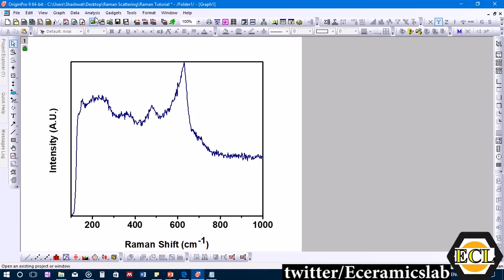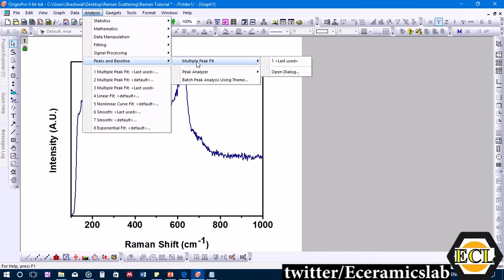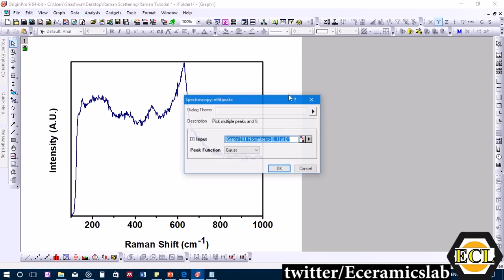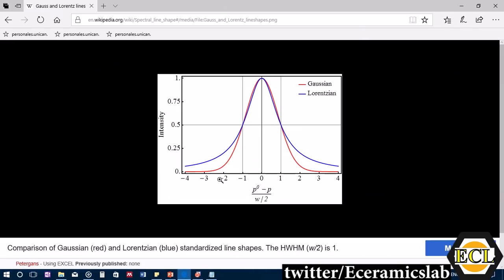To start the fitting, we go to Analysis → Peak and Baseline → Multiple Peak Fit, and click 'Open Dialogue.' It asks for a peak function for deconvolution and curve fitting. You need to provide a shape function such as Gaussian, Lorentzian, or a product or combination of both.